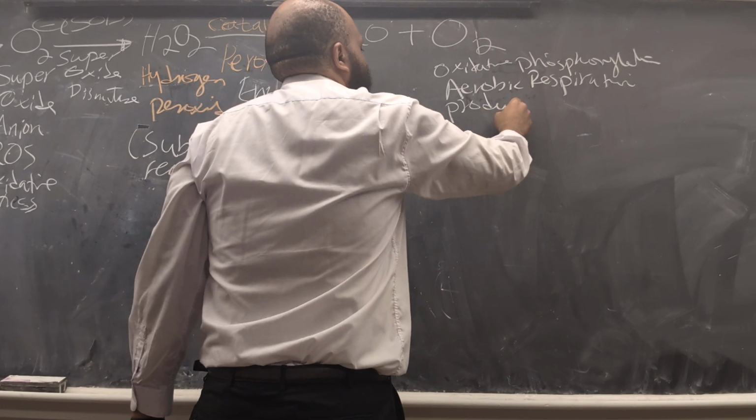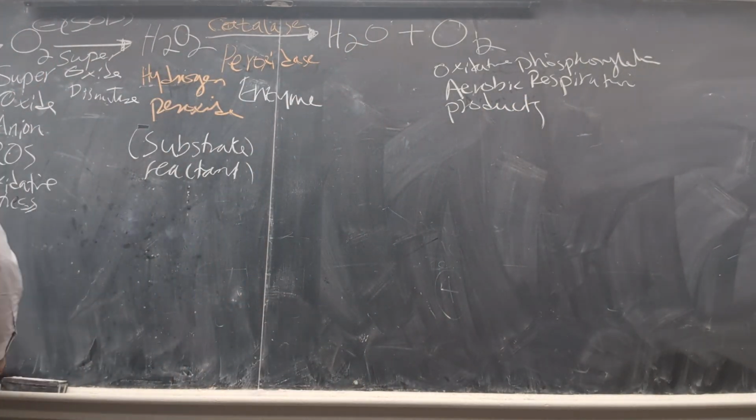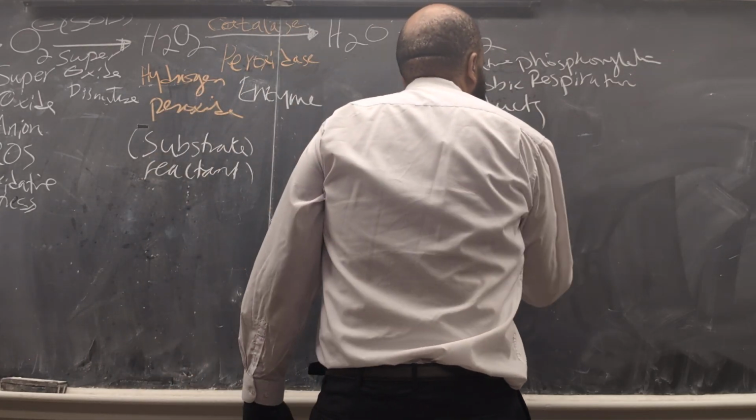So what happens now? What happens is we have this guaiacol. Can everybody see guaiacol? We already identified hydrogen peroxide. Now you have to identify your guaiacol. This guaiacol, what does it do? Guaiacol is colorless.